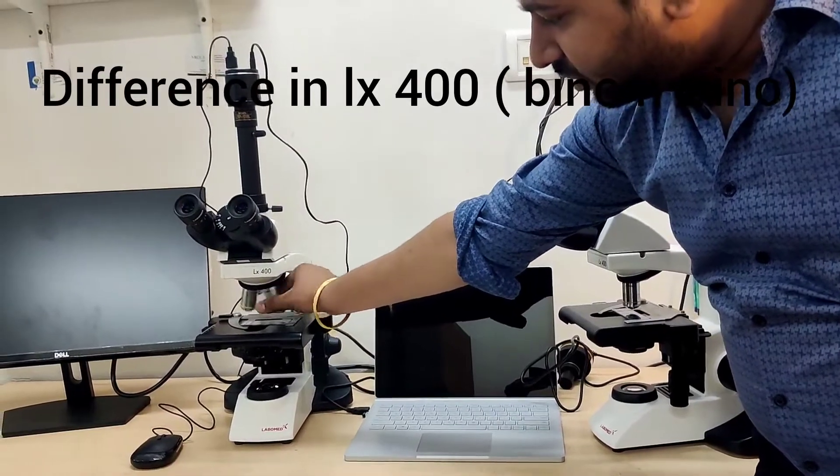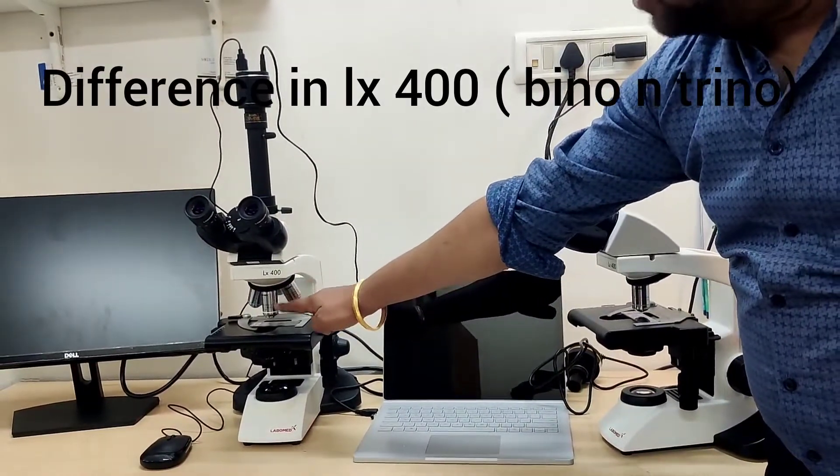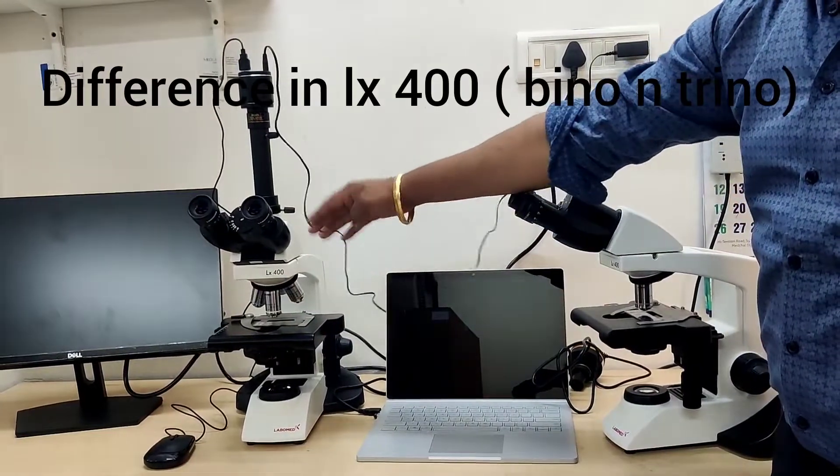4X, 10X, 40X and 100X. Single objective is in front of you and other 3 objectives are in the back side.